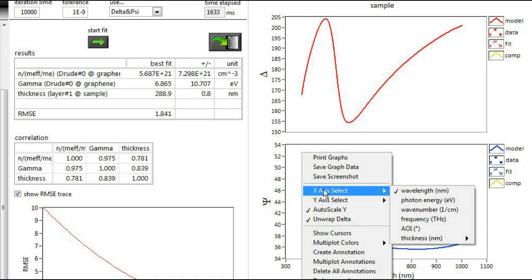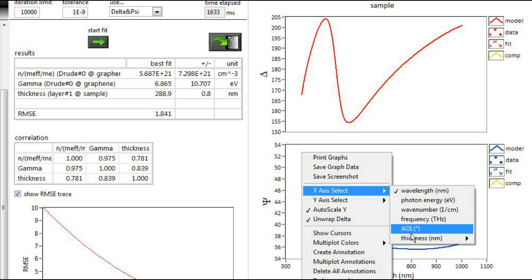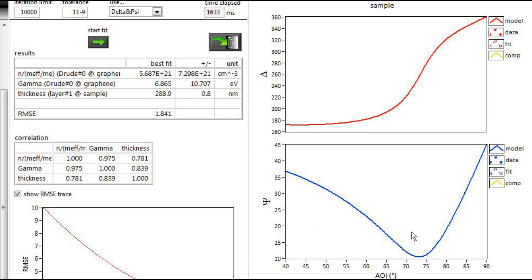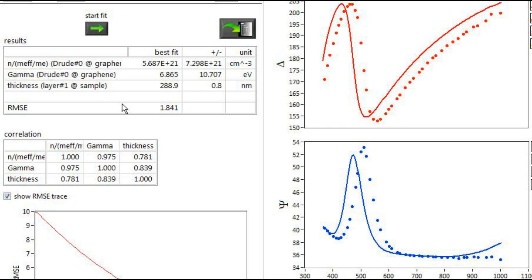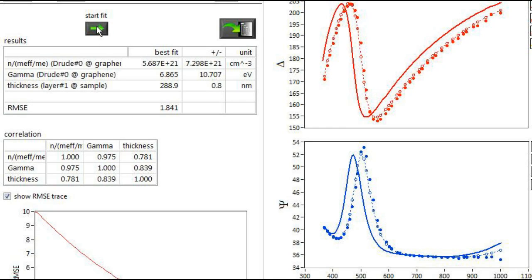The simulations can also be displayed as a function of wavelength, angle of incidence, or other variables. After selecting the fit parameters, for example, the thickness of a layer, you may start the fit process.